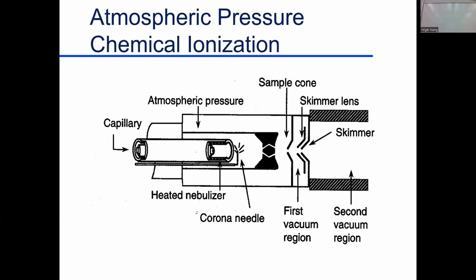I use it for a different methodology. I'm interested in what people exhale. Whenever you swallow a food, you'll always have an exhale breath. I think I probably show this later on. You always exhale. And that exhale is what comes up past the olfactory region and says, oh, smells like cherry. So this whole idea of being released in the mouth, transferred into the airstream, is how much of the sensing goes on. So I'm interested in what's in the air in your mouth. And so we actually put these in people's mouths. We put them up the nose and we can sample what people have taken into the mouth. I think I've got a picture of that coming up probably next lecture. So fascinating what you can do. I can detect what's given up in your mouth that actually gets sensed, forming your opinion of that product.